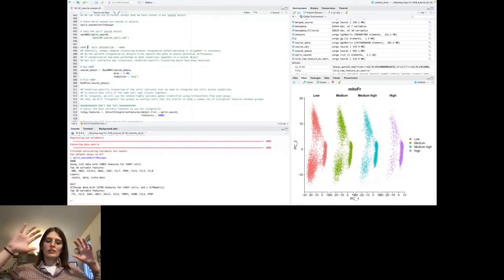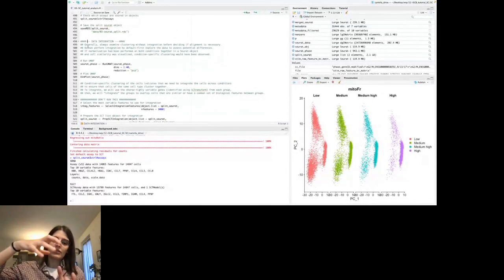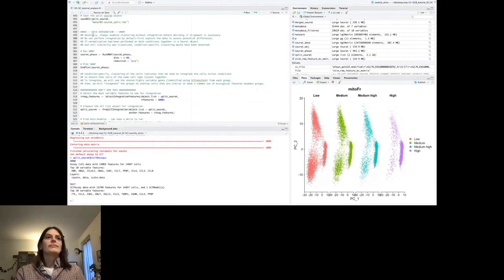Now that we have transformed our data for each of our samples, we can now integrate it. So we can find the anchors and integrate the information in order to put the cells on a comparable, let's say, plane, okay? Then, just a note, do not perform the integration just by default, but always analyze the data to see if the integration is needed or not, okay?